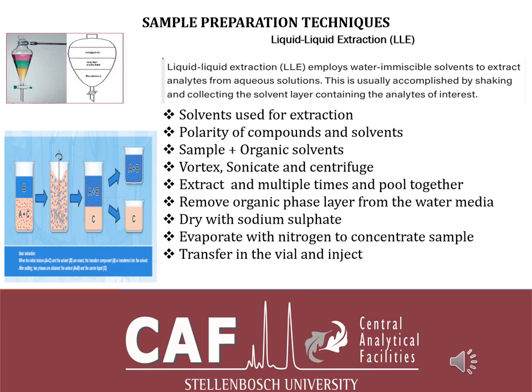It depends on what you're using. If you're working with dichloromethane, for instance, your dichloromethane will be at the bottom and the water at the top. If you're using ether, your ether will be at the top and your water medium at the bottom. So you can just release depending on where your organic solvent sits.